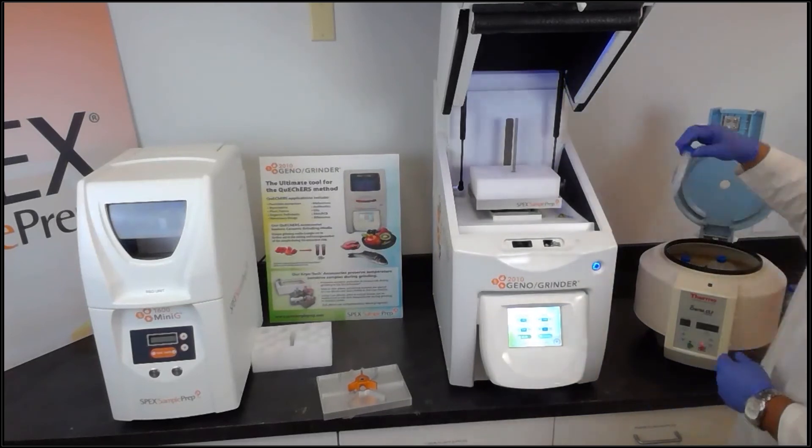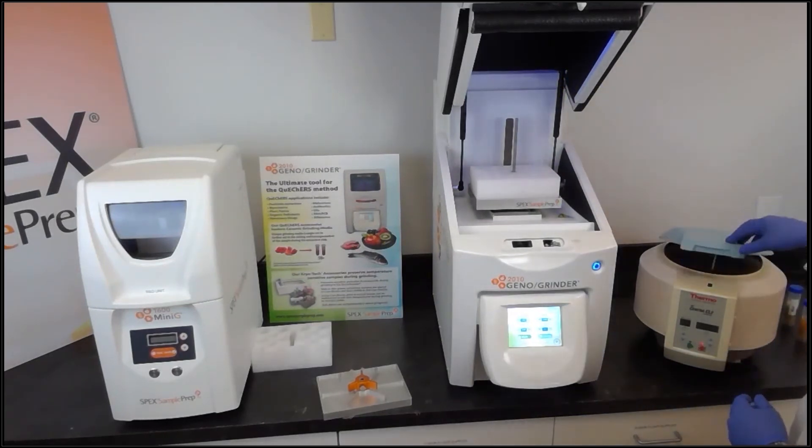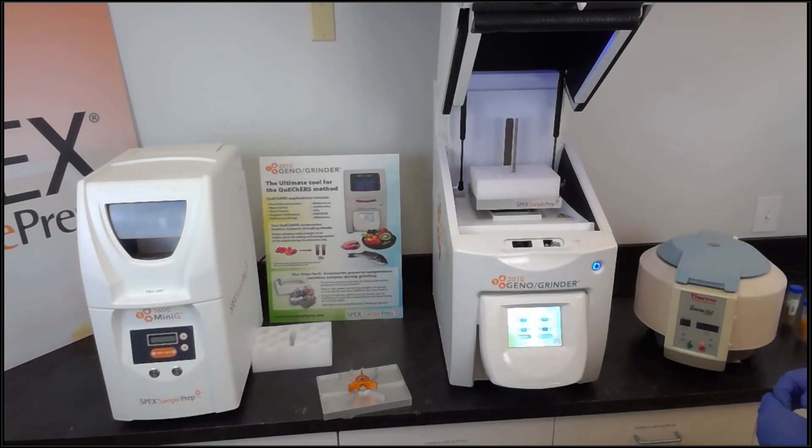We'll use a blank as a placeholder to keep everything balanced, then close the centrifuge lid. We're going to set the speed for 3500 RPMs with a one minute runtime and simply press the start button.